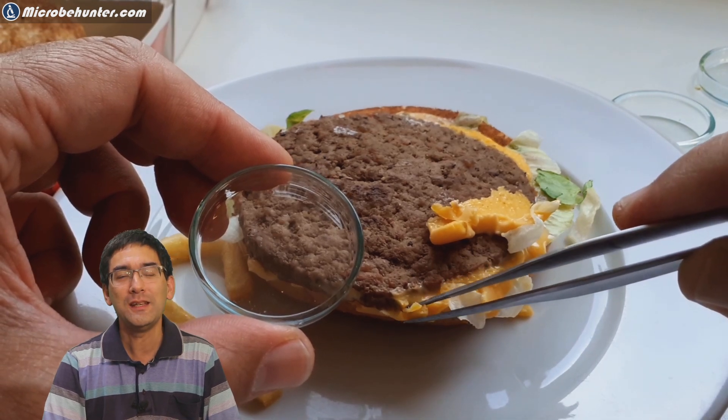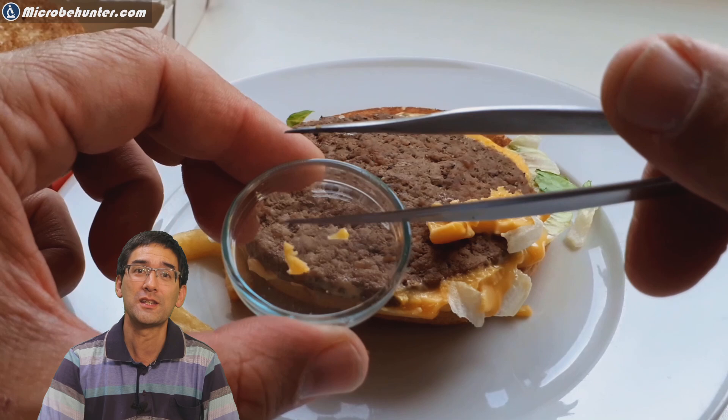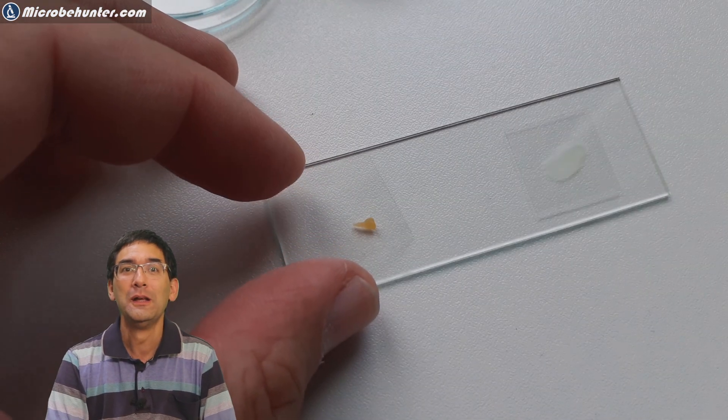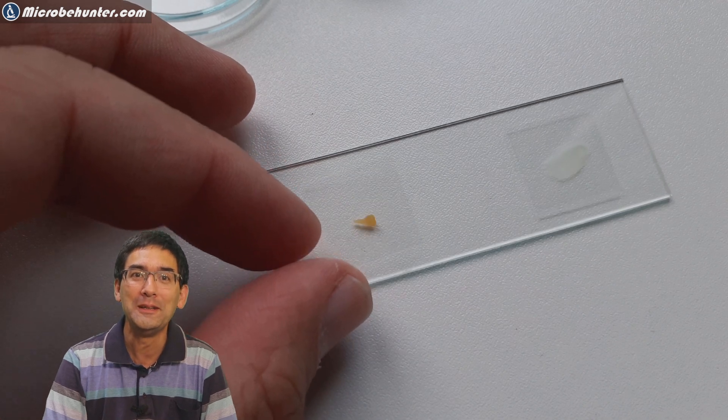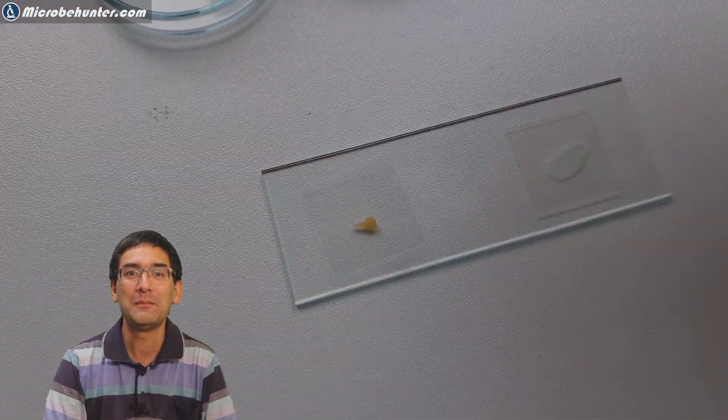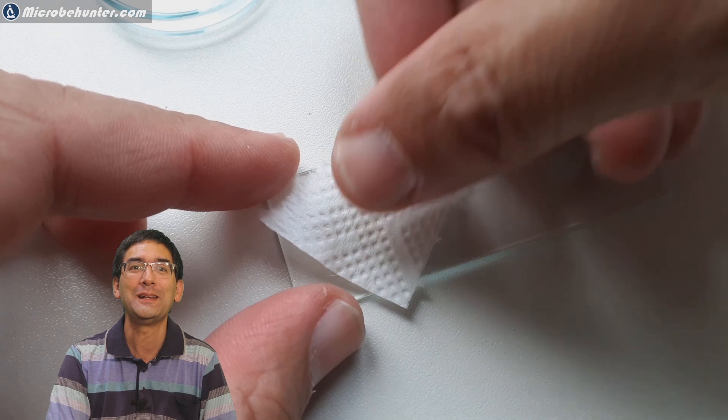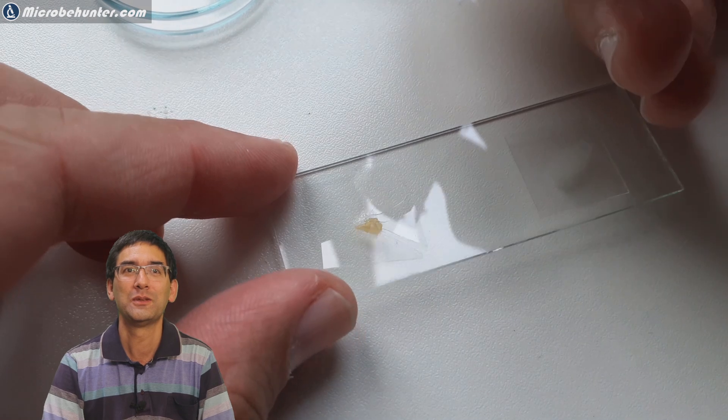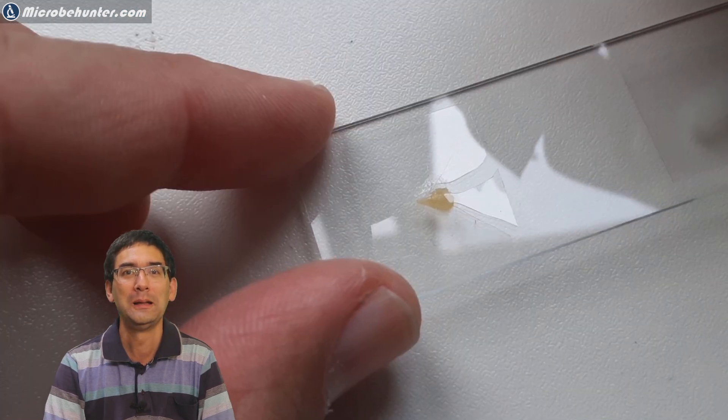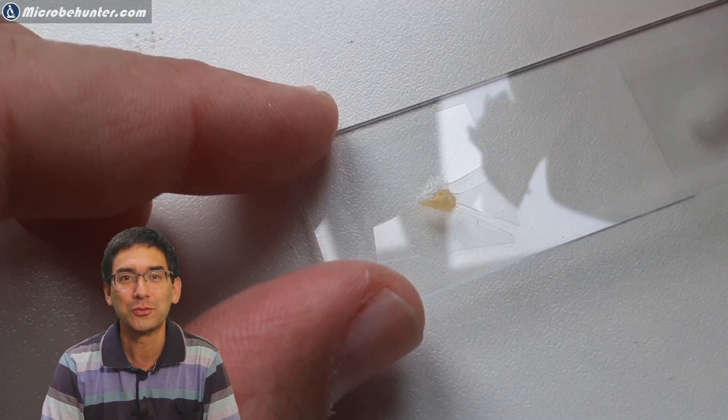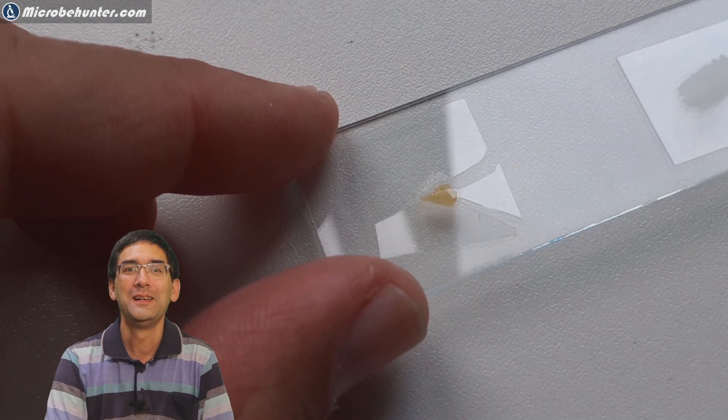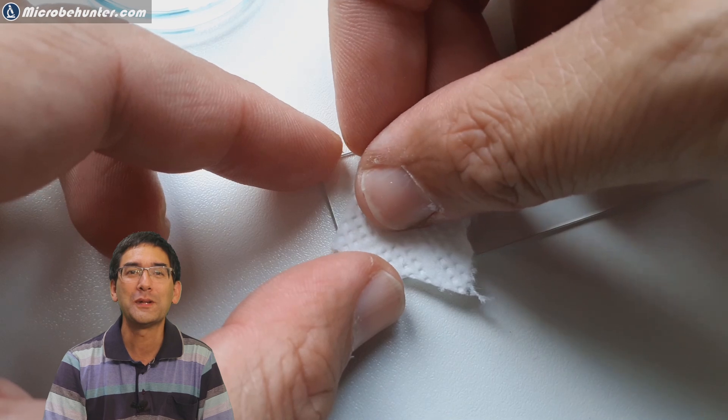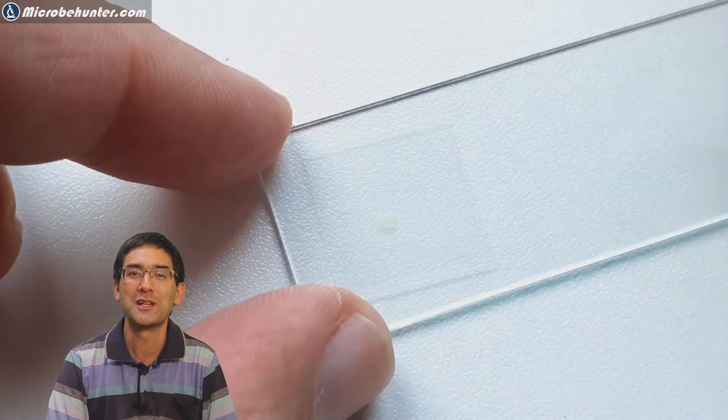The cheese. This cheese is again a homogeneous material - individual cells not visible, mostly coagulated protein. My hopes were not very high to find anything interesting. I again compressed it, and unfortunately this did not work out quite well because the cover glass cracked. What do we learn from that? Take very small samples that can be compressed easily, and do it carefully - you don't want to hurt yourself with broken glass.